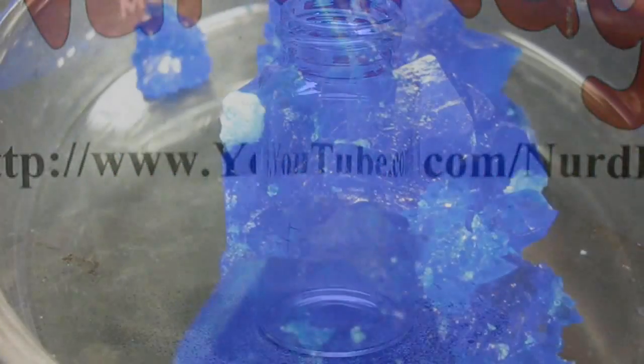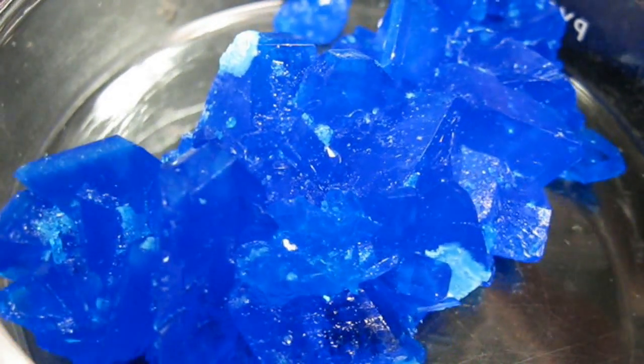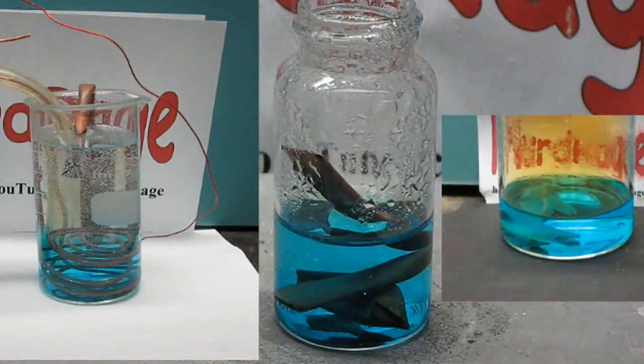Greetings fellow nerds. In this video we're going to make copper sulfate for those of you interested in the chemistry. And we'll show you three ways of doing it.